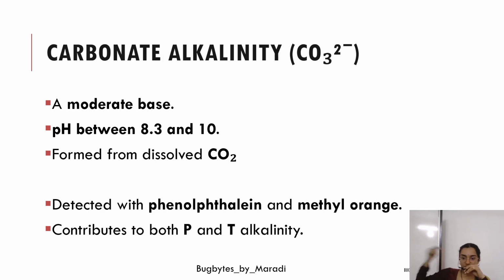We'll be doing another experiment showing how to calculate dissolved carbon dioxide. At that time I'll be speaking about the entire scenario of dissolved carbon dioxide. Mainly if you have dissolved carbon dioxide and you're treating water with lime, at that time you'll be having the carbonate alkalinity. Again, if you're taking a water sample and adding a phenolphthalein indicator to it, it turns pink. That's a thing you should know.